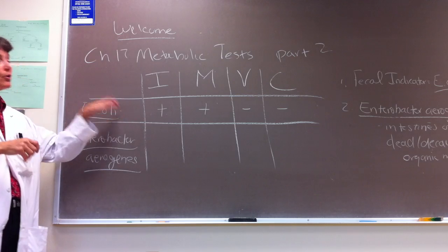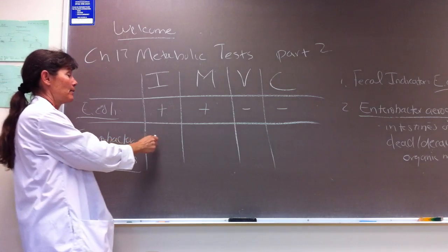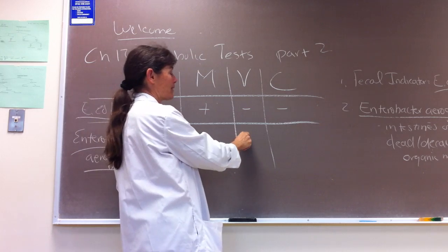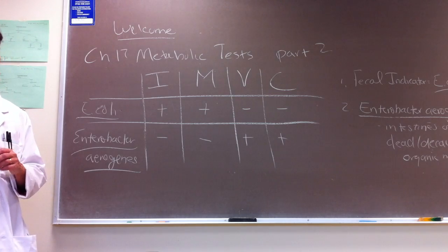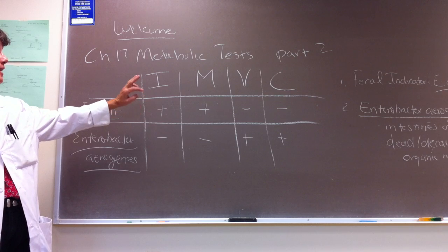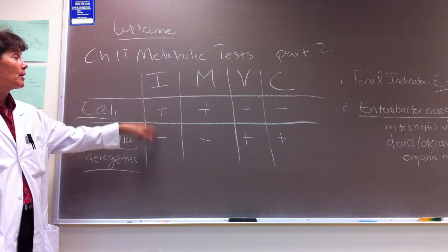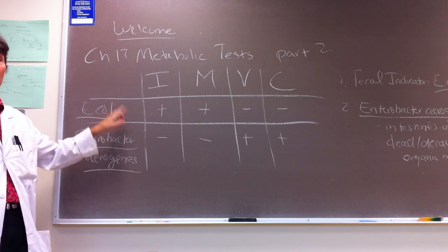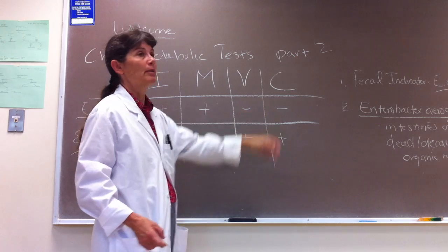Okay, so if you know the E. coli results and you know Enterobacter aerogenes is the opposite, what can you tell me about Enterobacter indole? Negative. Negative. Positive. Positive. Dynamite, you guys. So what we hope you're going to see today is that your E. coli and your Enterobacter aerogenes give these exact opposite IMViC results. Now you already ran the indole dry slide. Did most of you get a positive indole in E. coli? Yes. And negative on Enterobacter? Yes. Good. Okay. So we're going to follow up on these last three results.